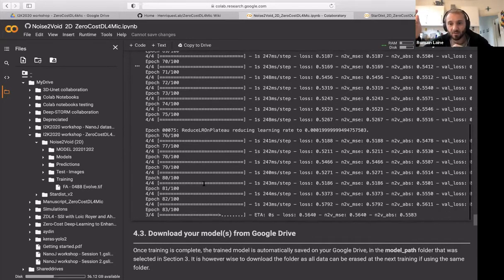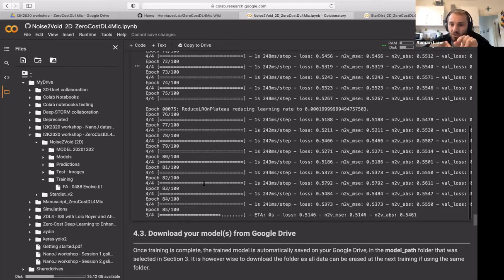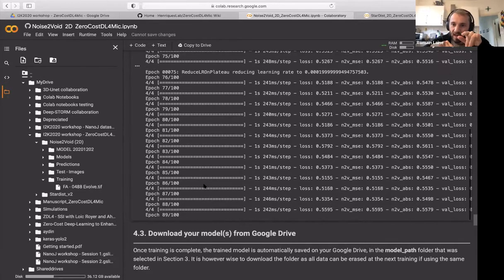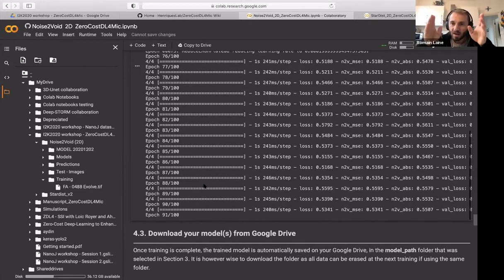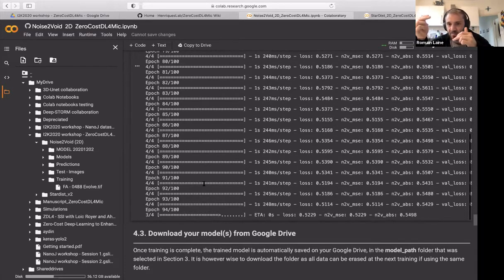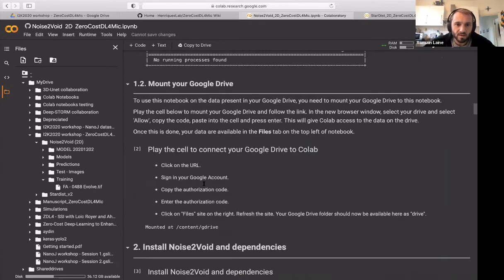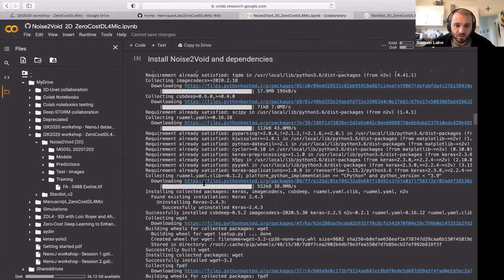The larger the error, the larger the step. But we also have a little tuning factor to set how big those steps are. So there's two things. The error will define how big the steps are, but that learning rate will also depend on that.